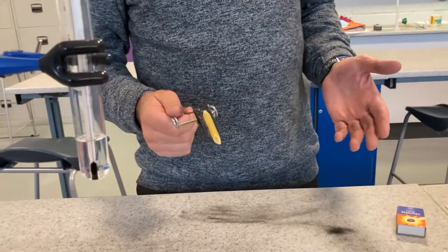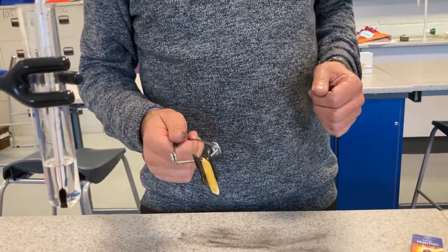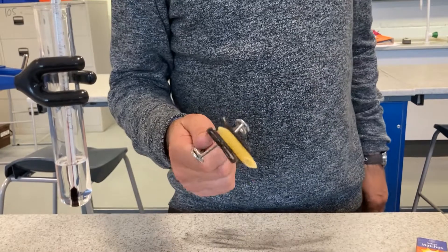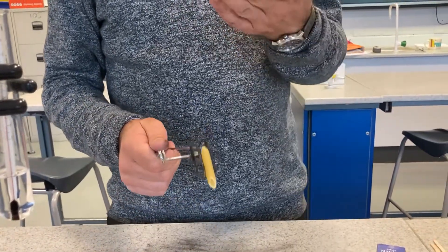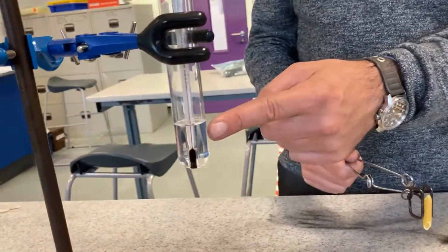Today, I'm going to show you how we can find out how much energy is in food. I've got a bit of pasta, and I'm basically going to burn it — react it with oxygen and release the energy. But to find out how much, we need to set things up like this.